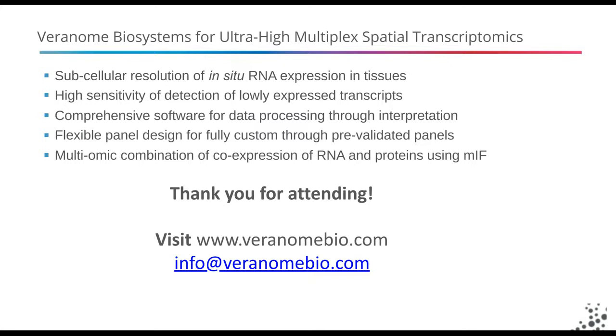And so it's more of a matrix for how long an experiment will take based on those parameters. So there's not a straightforward, one size fits all type of run. It's tunable to your particular experiments.